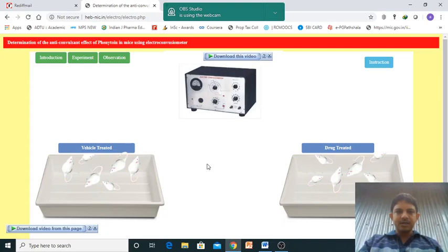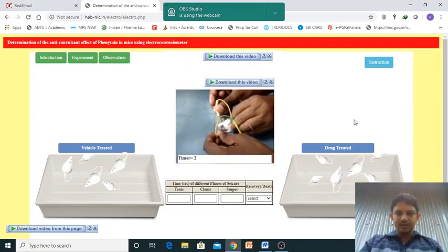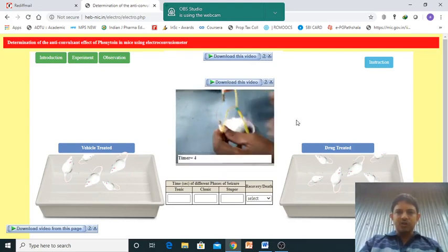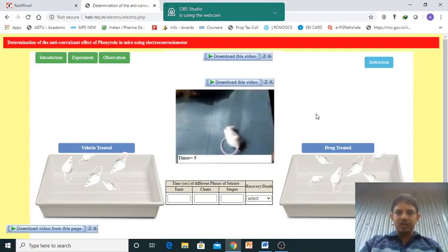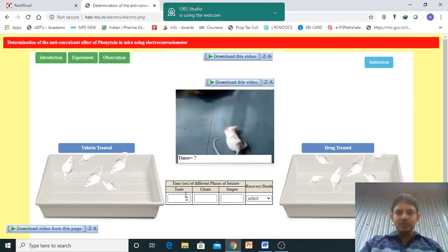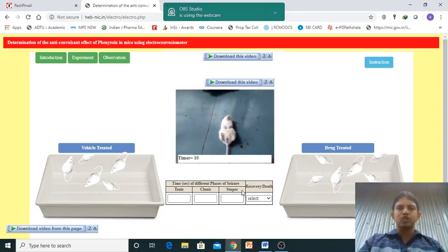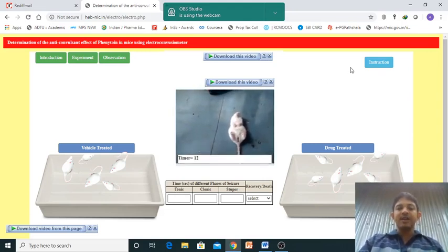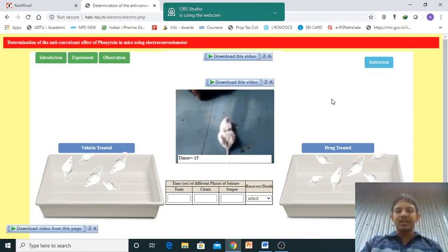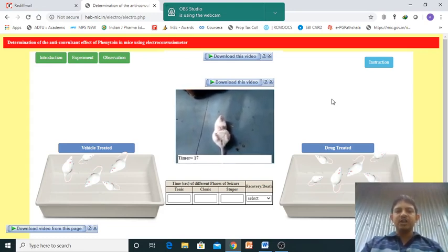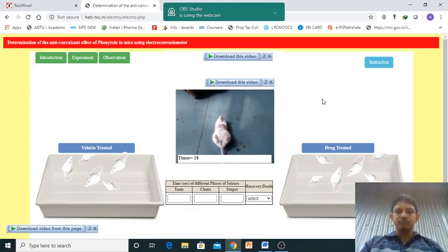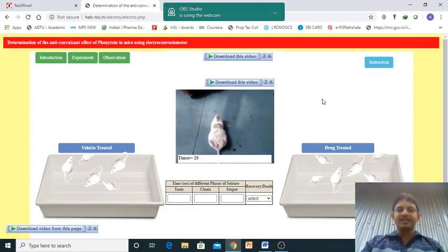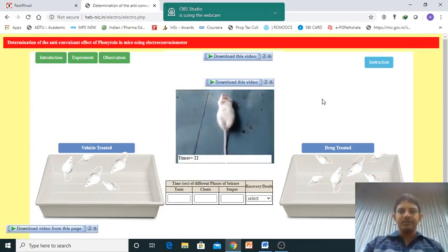Now I'll click into one experiment. You just observe it first. Electric shock into the corneal electrode - electric shock will be given. Here you can find the three steps: tonic, clonic, and the stupor phase. Now how to identify which one is the tonic phase, clonic phase, and the stupor phase? Just observe the video, I'll discuss it for the next animal.